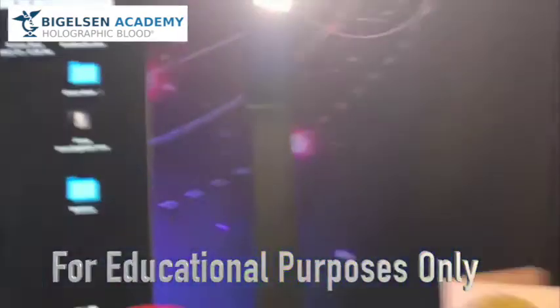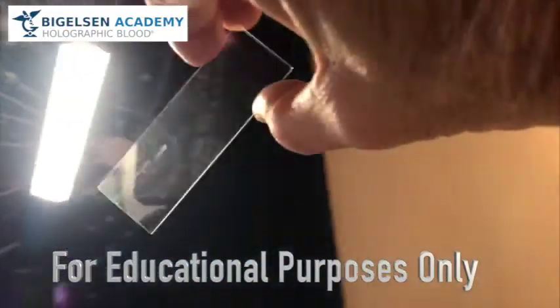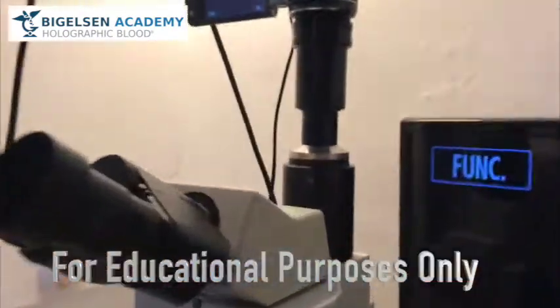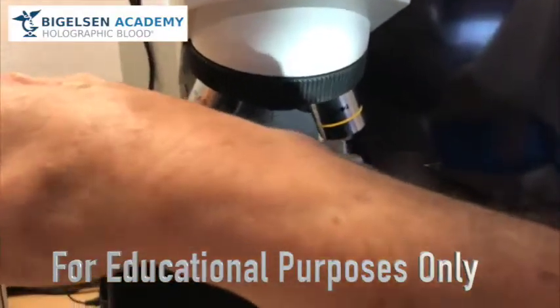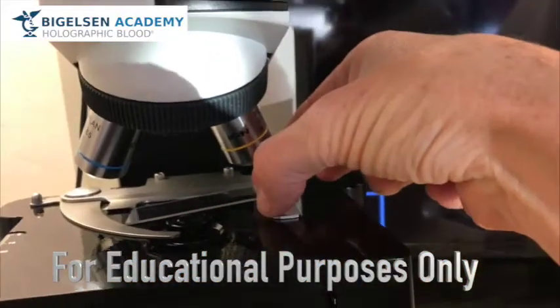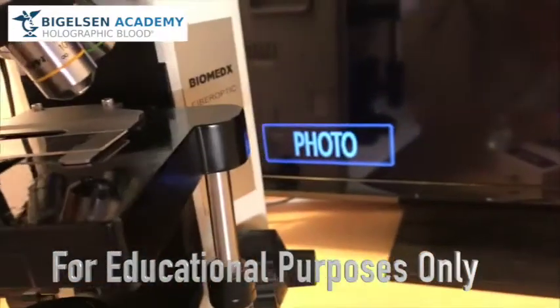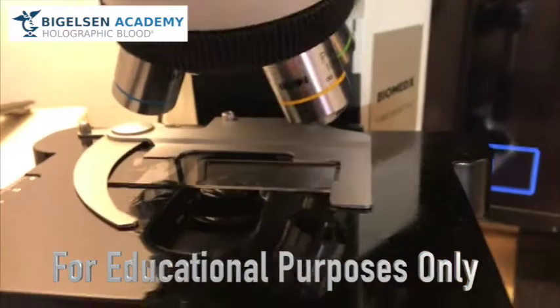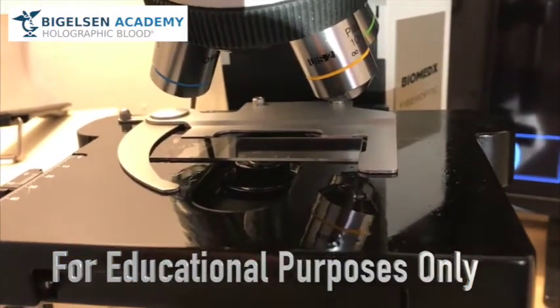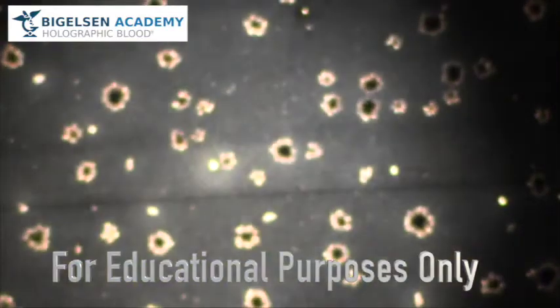Here's me again. Adam real quick — just showing you this is that same slide. I'm taking it right now over to the microscope and putting it on. Trying to do this with one hand, which kind of sucks. One-handed microscope work. It's on the slide. Turning off my camera on the phone. You're hearing me on the video camera. Camera should start to see the image in just a moment. There we go.